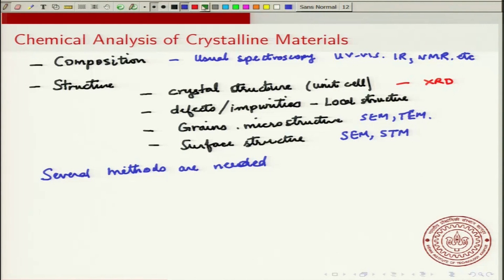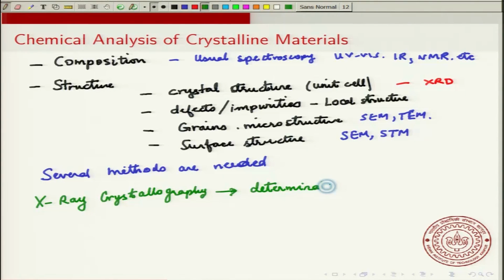Now, coming to X-ray crystallography. This refers to the determination of the exact structure from X-ray diffraction analysis.